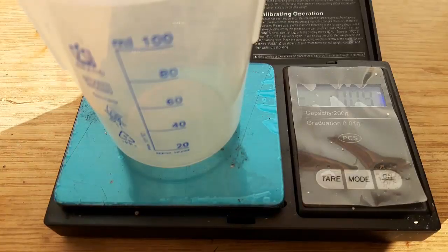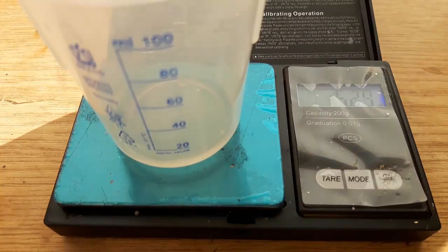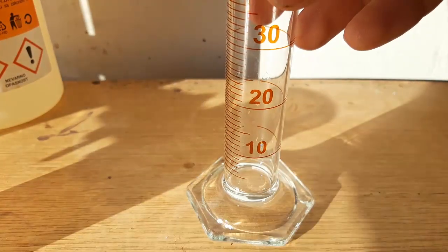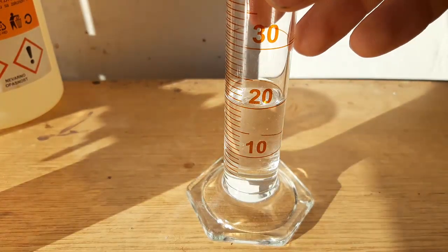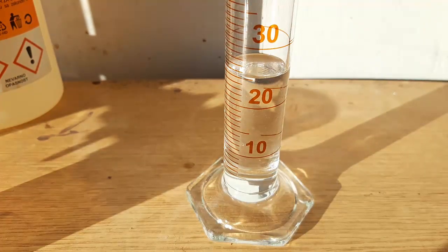In a second beaker, we measure out 5.3 grams of benzaldehyde. We need a bit of solvent here as well, so we measure out 24 milliliters of ethanol and 6 milliliters of concentrated hydrochloric acid.